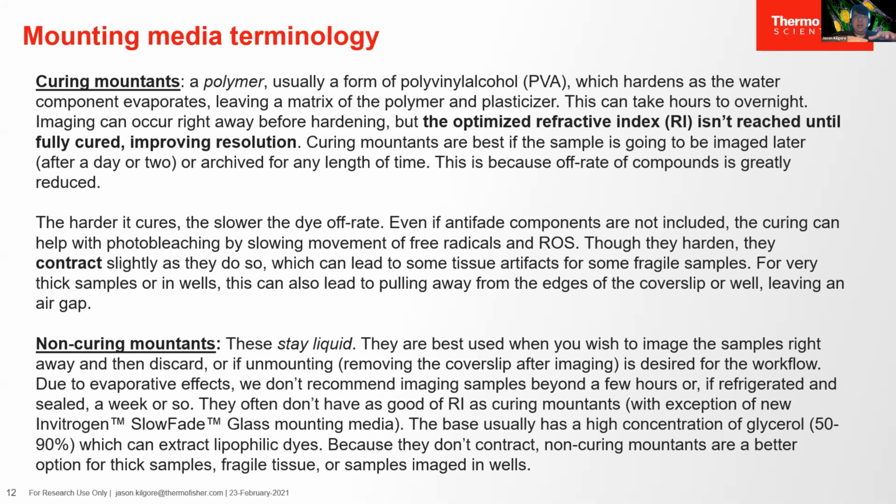Once they reach a fully cured state, you get the best refractive index for the best resolution. And also when it cures, it slows the off rate of conjugates and dyes. So that's another reason to go with curing.